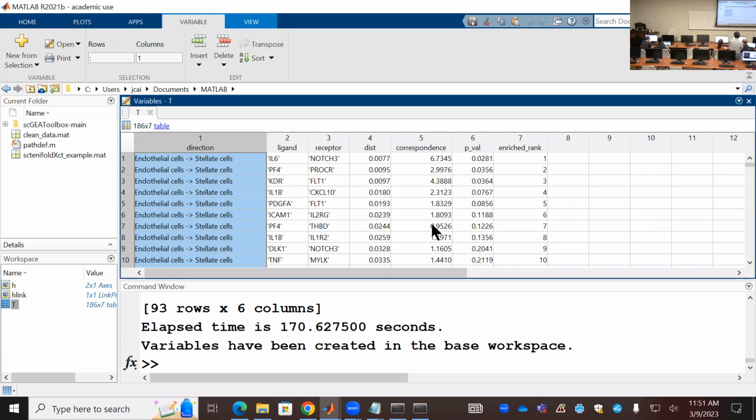Yeah, try this with your hypothesis. You can try with like 2,000 genes first, then expand to 5,000 genes, and at the end 7,000 genes. Because once you have the list, you have some time to think about it. Then you expand your space of the genes.